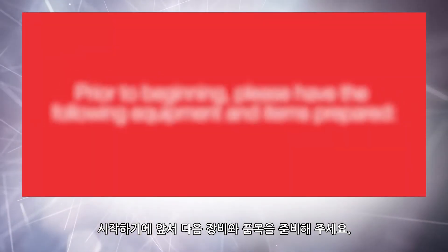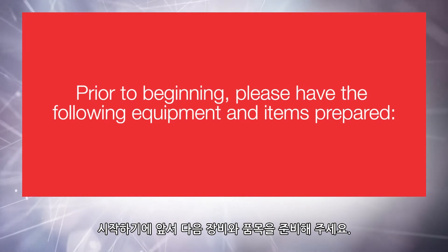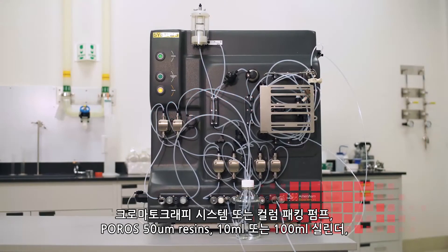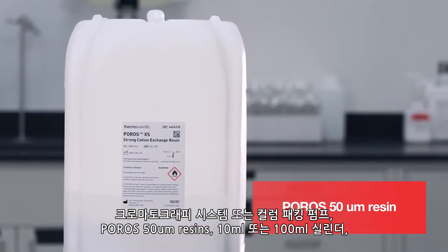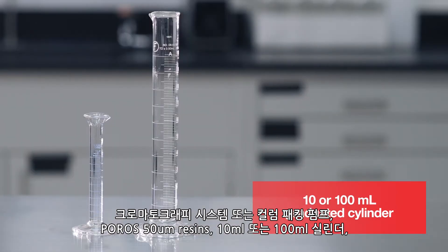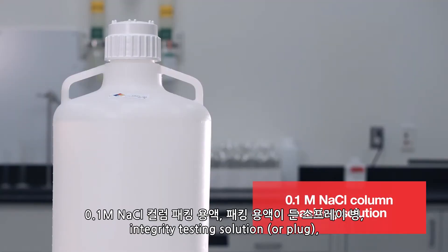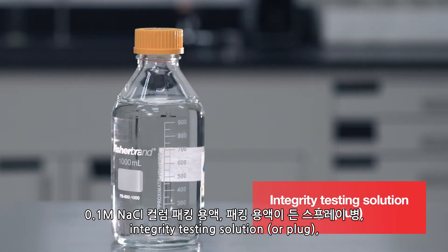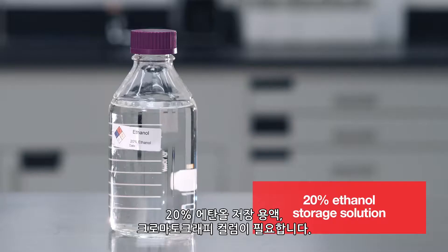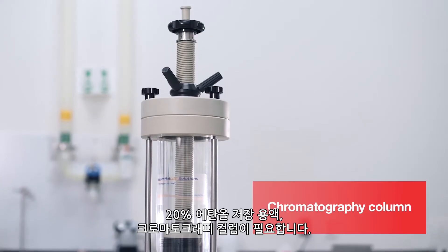Prior to beginning, please have the following equipment and items prepared: a chromatography system or column packing pump, Poros 50 micron resin, 10 or 100 milliliter graduated cylinder, 0.1 molar sodium chloride column packing solution, squirt bottle filled with packing solution, integrity testing solution or plug, 20% ethanol storage solution, and a chromatography column.